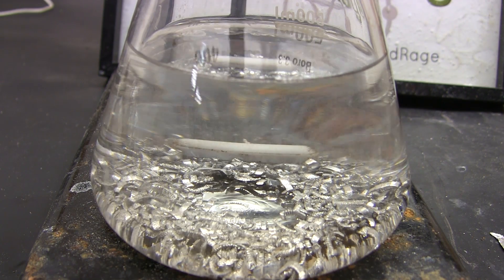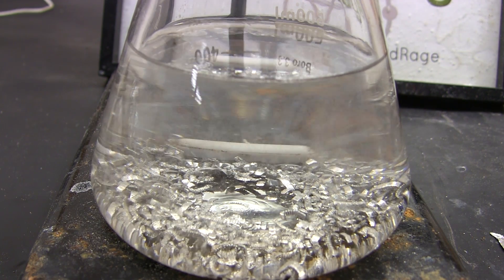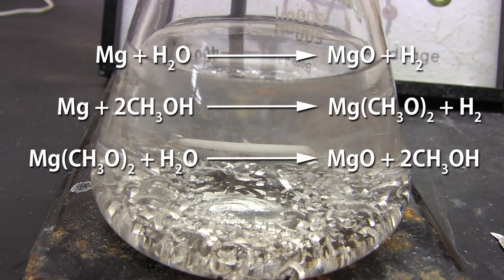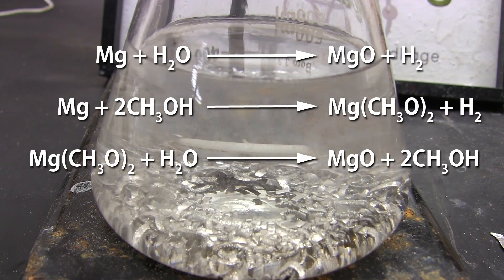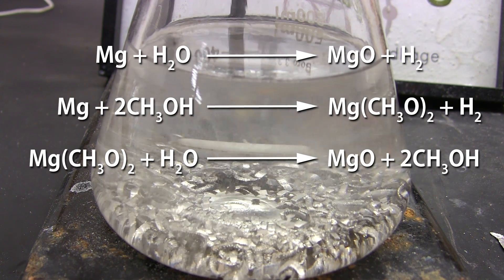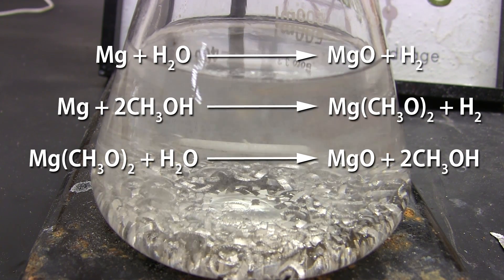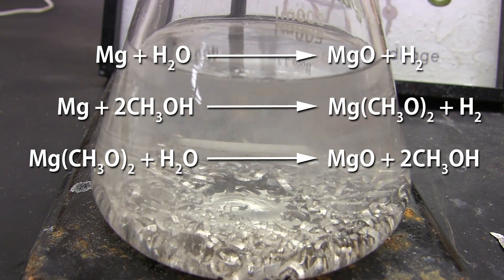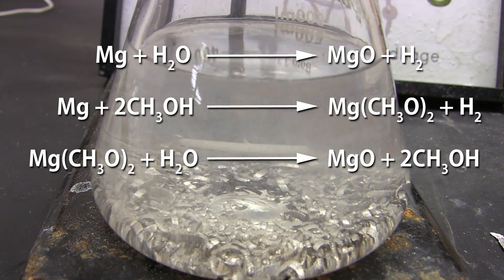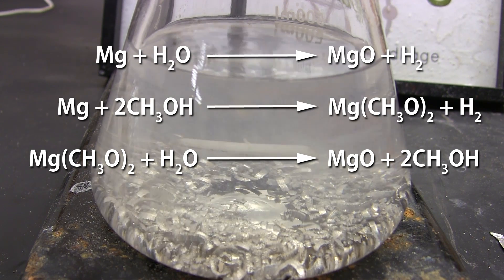Methanol is very reactive with magnesium and you can see bubbles forming. The magnesium is reacting with water to produce magnesium oxide and hydrogen, and also reacting with methanol to form magnesium methoxide and hydrogen. The magnesium methoxide then reacts with any additional water in solution to make magnesium oxide and methanol again.